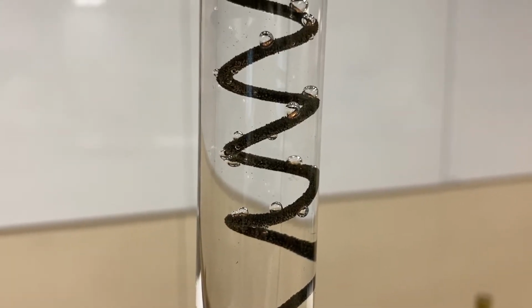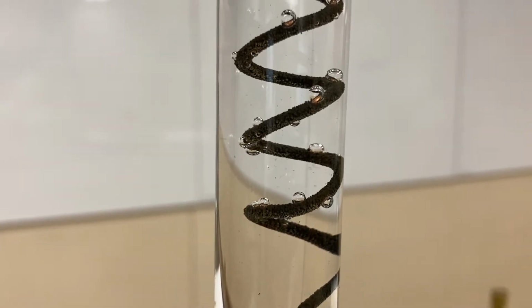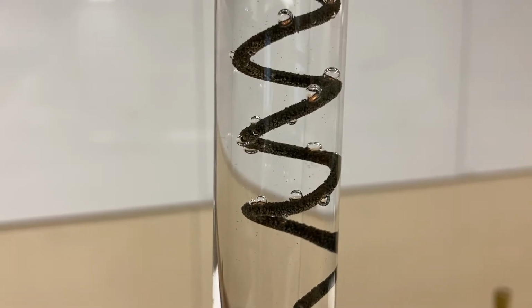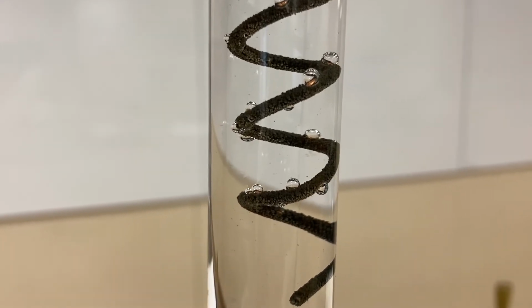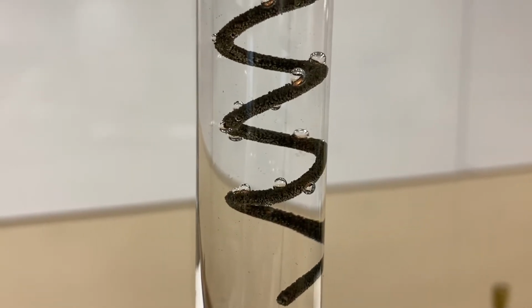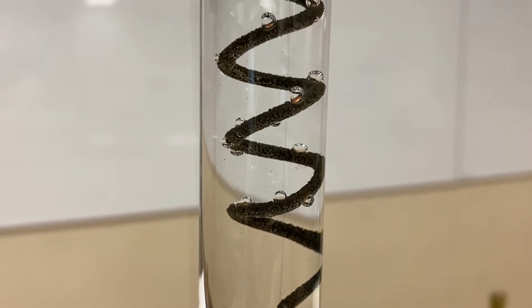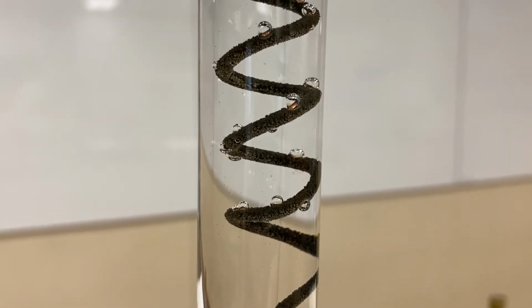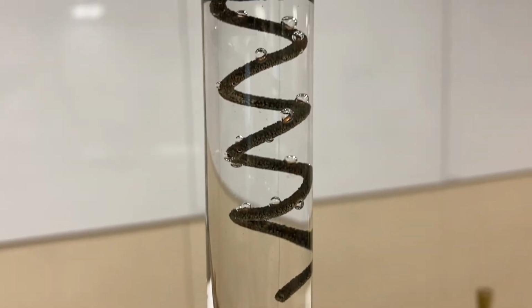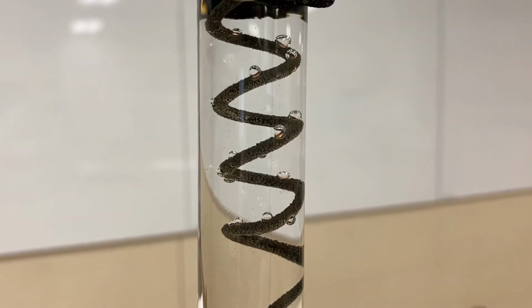Okay, so this was the copper wire, and you can now see there are these little crystals that are forming around the copper wire. You can even see those tiny little kind of dark flakes that are falling around in the solution. And the longer it goes, the more and more crystals that form. Okay, so I'll come back in a minute to show you what it looks like in 1 minute, so you don't have to actually watch the whole thing.